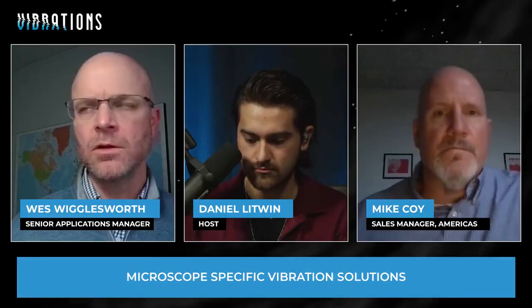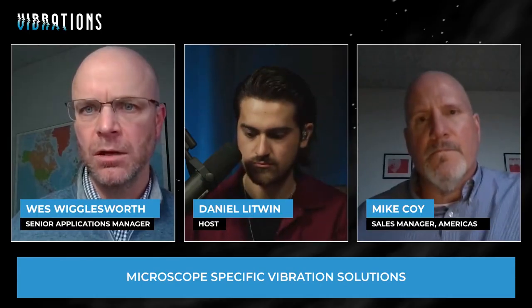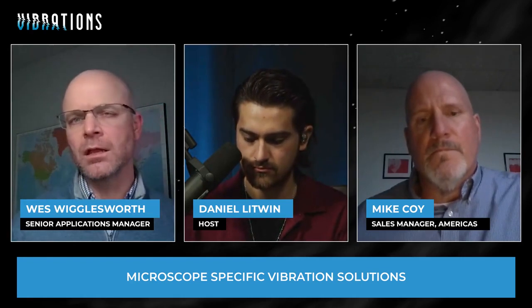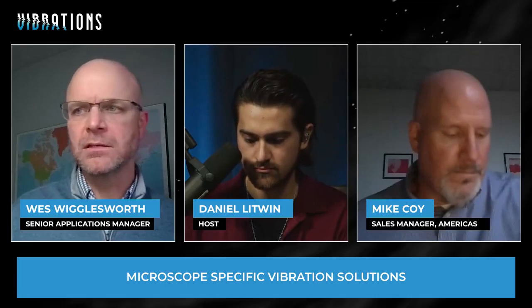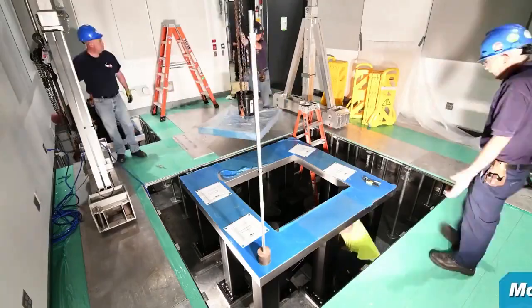And again, you want to be measuring the vibration well before you take delivery of the microscope, so that you can plan ahead, explore the options, understand the solutions, and ensure that you're really installing the right solution that's not only going to address the vibration levels that you see in the survey data, but also future-proof against vibration levels that inevitably are going to increase after the facility is populated, or there's a construction project next door or even a mile away.